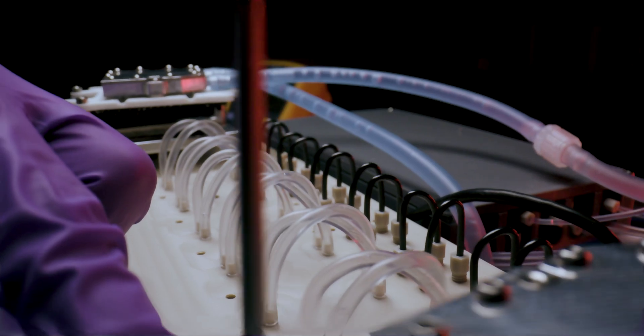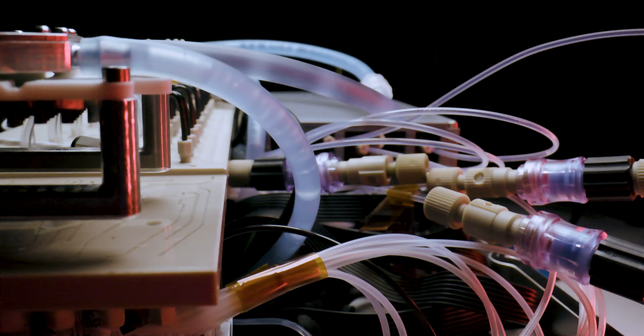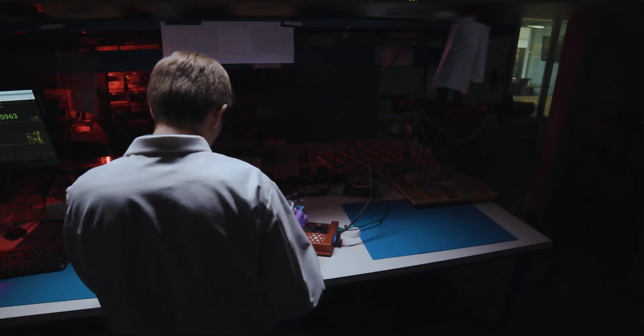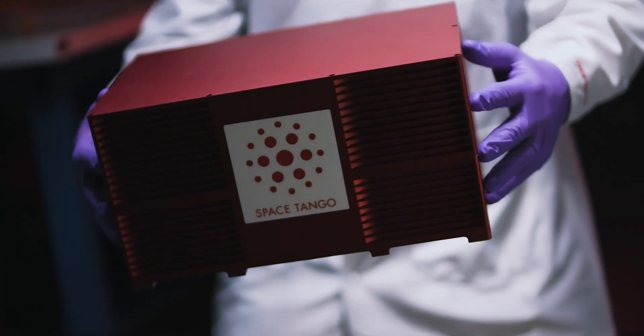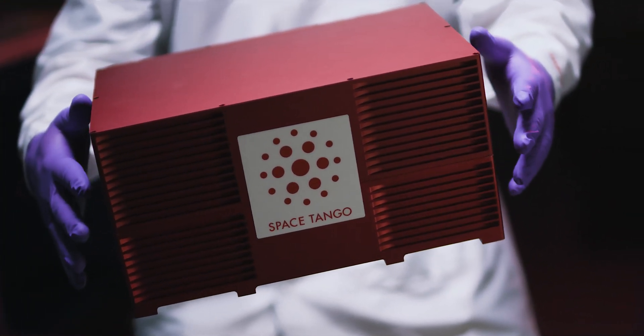Innovation is taking place in this cube lab. Technology carefully engineered to execute autonomous experiments and pilot scale manufacturing in microgravity.